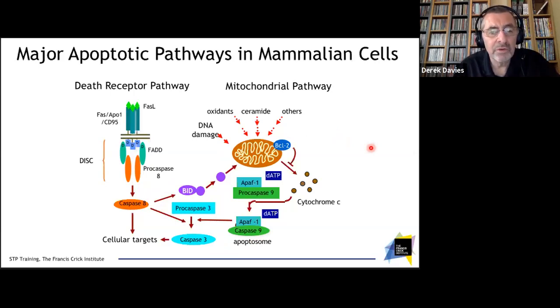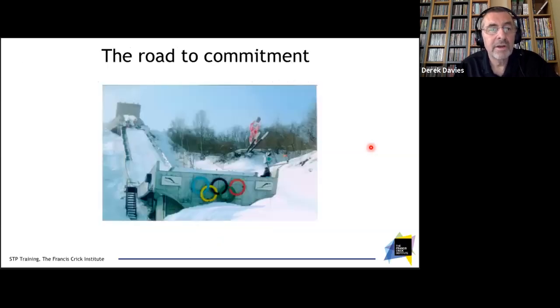And that's one of the things that we want to look at in flow cytometry, because we know that we're always going to add a viability dye in our flow cytometry experiments. And a viability dye normally measures the sort of end stage of death, if you like, the point when a cell is permeable, either to a DNA binding dye or a protein binding dye. We want to try and pick up cells at an earlier time point. We want to find here, really, where they've committed to cell death, but they haven't actually yet completely died. I'm sure this fellow is fine at the end of it, but this is where we're trying to pick up our cells, the physiological status before they get to what we would call a dead cell.